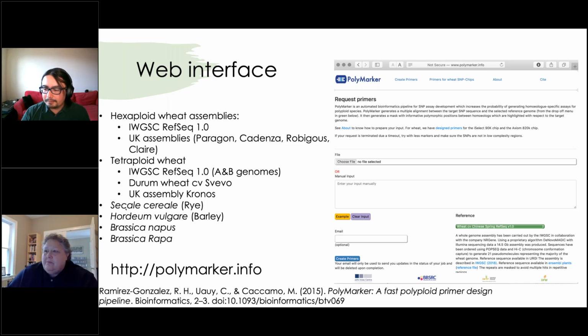All right, great. Now the next question is, if the reads for each chromosome are completely equal, can you still use the pipeline? You can. It will tell you that they are not specific, but that's a problem that you will have with the primers anyway, because if you cannot distinguish them visually or by yourself, PolyMarker will not be able to distinguish them. For those complex cases, we suggest to look for SNPs on the promoter region that tends to change more, and use that to genotype.